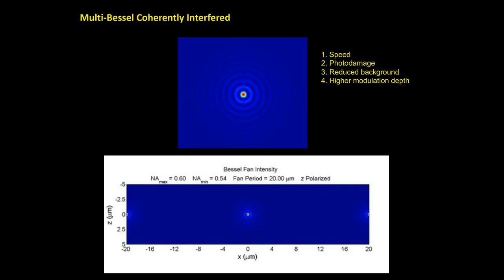As you can see from the movie, if you can control the distance between each Bessel beam, then you can get very good optical properties, which we call interference. As you can see, the intensity pattern keeps changing, so different distances give different interference patterns.